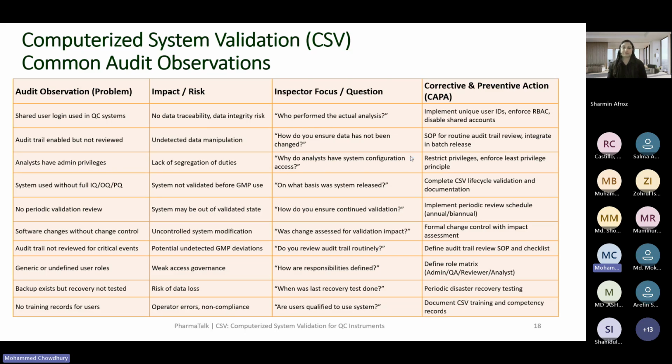If recipe creation is covered in the admin group, this privilege is supposed to be included in the supervisor or QA user access group.